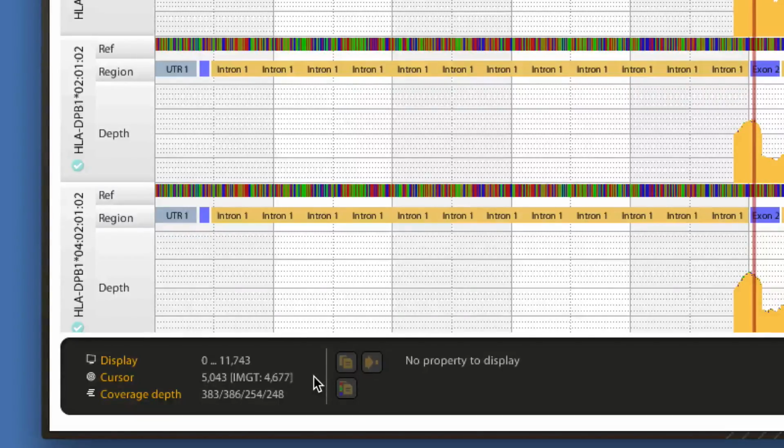You will notice that 2 values belong to each position. One of them is the nucleotide position relative to the start of the consensus sequence generated from your data, while the other one is the nucleotide position in the IMGT HLA database.